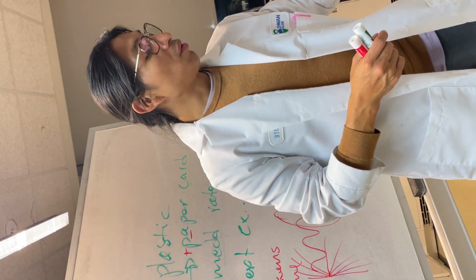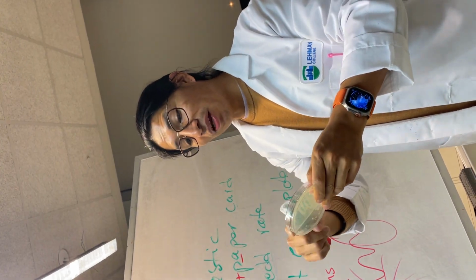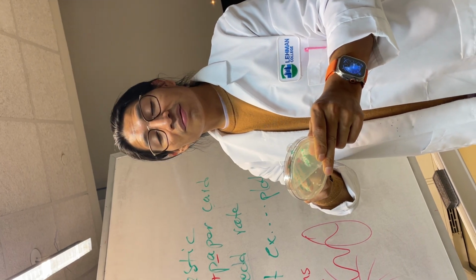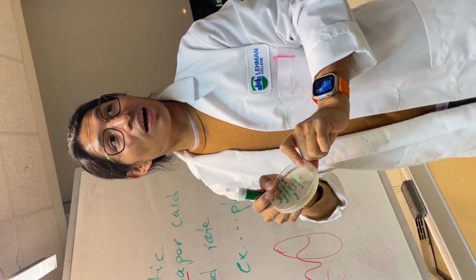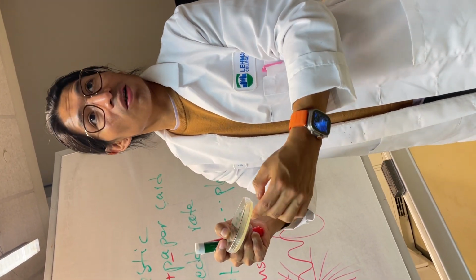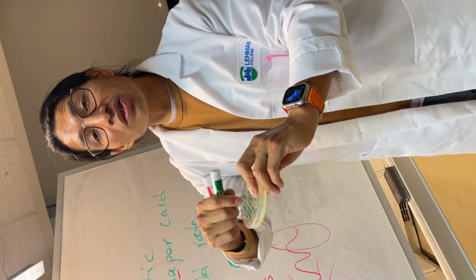Yeah, because our 4 has a lot of colonies. And this one is exactly what we're talking about. You see this? So in this one, in plate 1, we have bacteria, lid off, cover half. So we remove this, we cover, this is not half, by the way, I would not call that half, that's like 1/4. Bacteria colonies on this side are growing completely, but on the other side, they are not. There are only these colony formations in here.